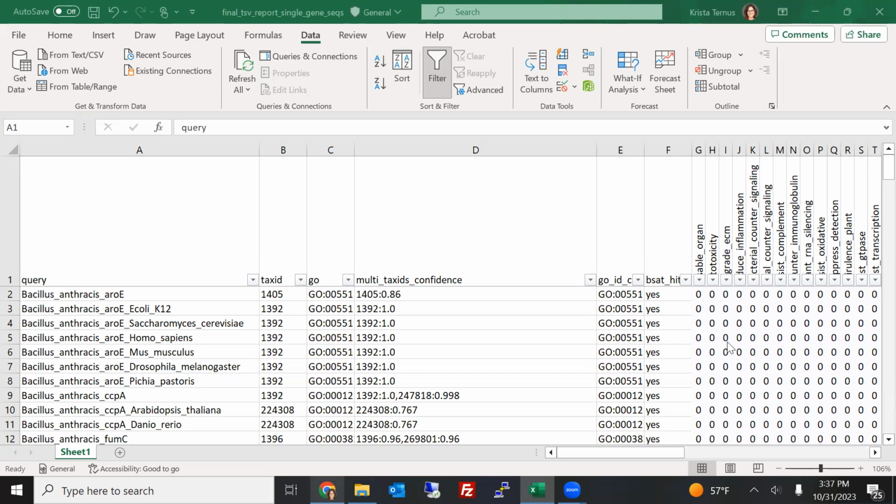Hi, everyone. Welcome back. Now that you've had a chance to listen to Jean tell you about sequences of concern and Todd tell you more about SeqScreen and details about the different workflows and how it operates, I wanted to revisit this example SeqScreen output that we had looked at previously to tell you more about the different columns of output now that you have more context for what is going on and what's happening here.